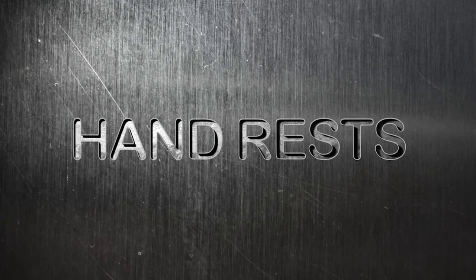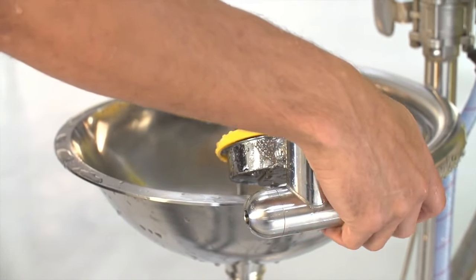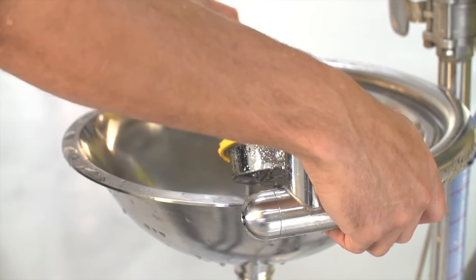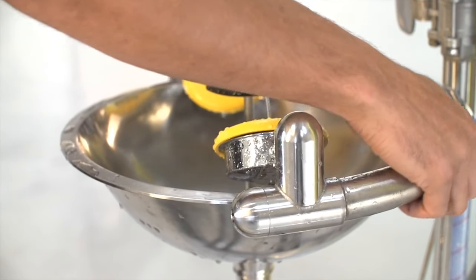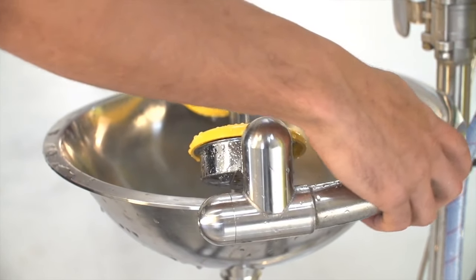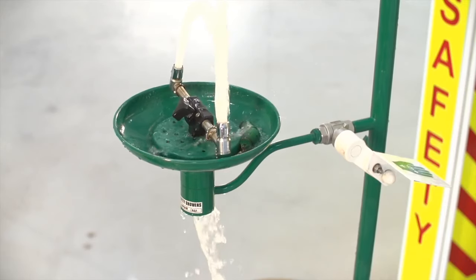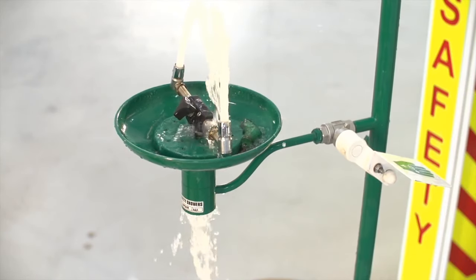Hand rests: In the event of an emergency, people will often require somewhere to hold on to, placing their full weight on the shower or often collapsing entirely onto the unit. Ashley's shower has smooth hand grips, and its overall construction is more than capable of holding someone's full body weight, where others would bend and collapse under the weight.